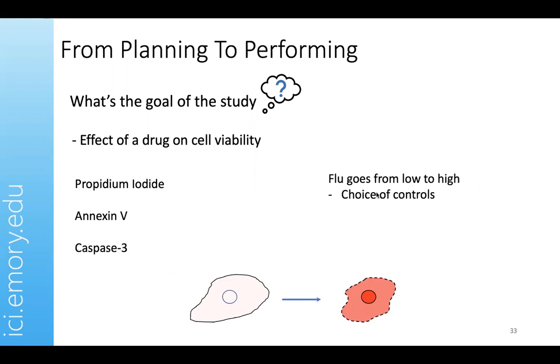Because you're going from something like this on the left to something like this on the right, where something is fluorescent. Most likely you will end up facing a problem where your images will either be super saturated or your images will be undersaturated. Okay, and we will talk a bit more about what saturation means later on in this talk.